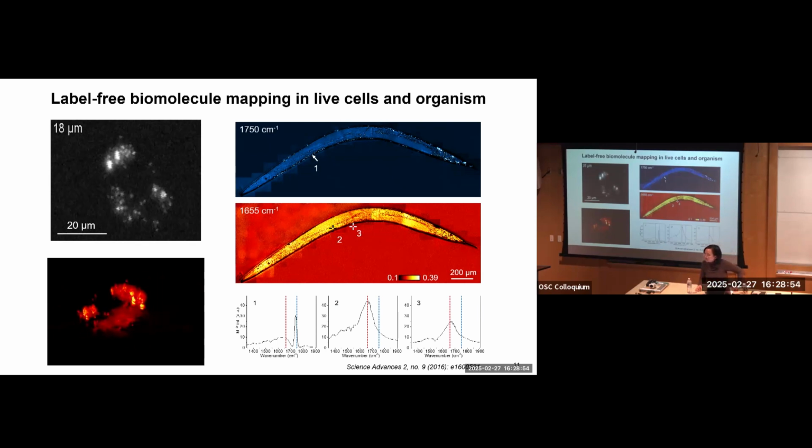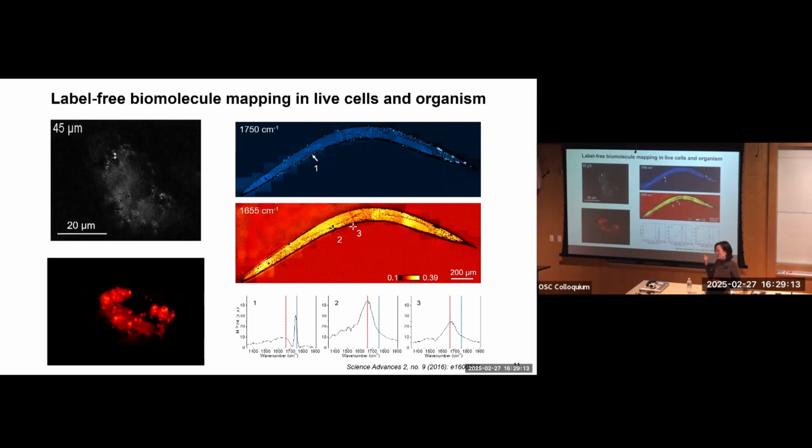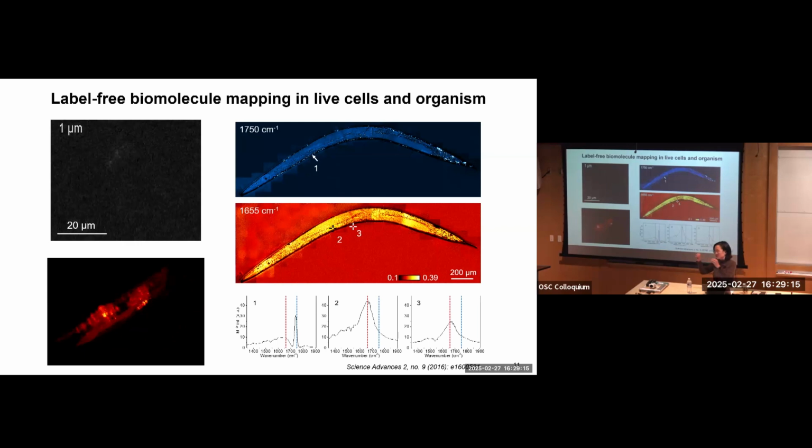What is the physical mechanism of your contrast in the visible? Is it the change of refractive index? I think it's both, because the heat will cause expansion, and when the volume is bigger, the index will be reduced. So sometimes we call this technology the thermal lensing effect. Basically, your index is changing.